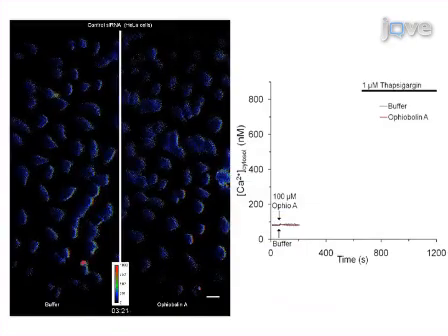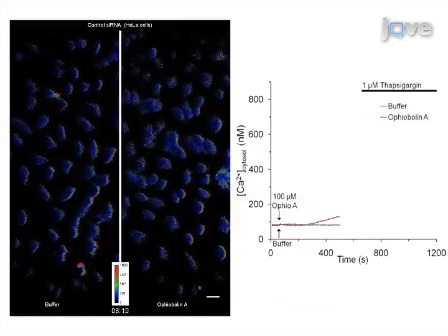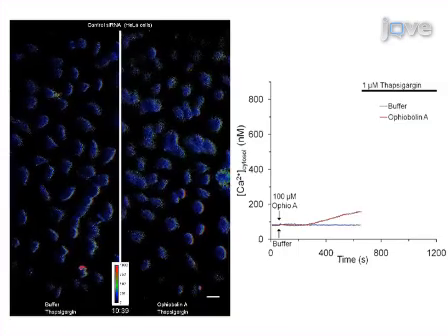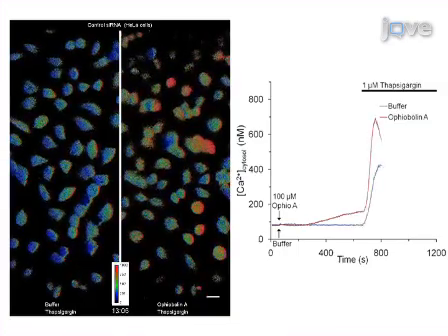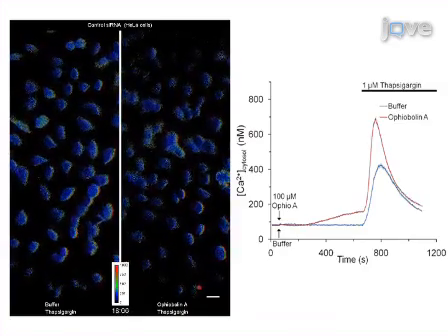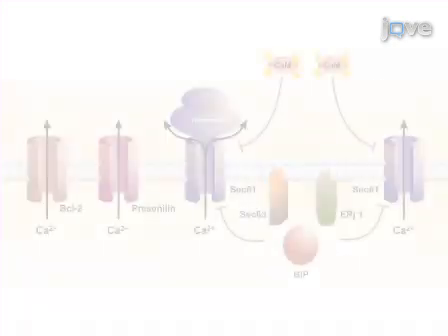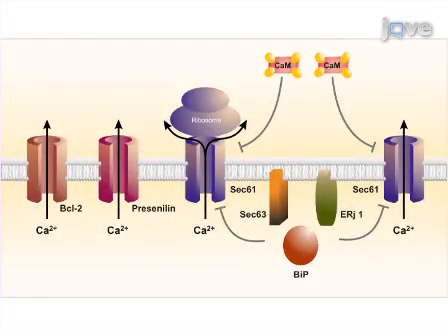As the calcium levels are measured, solution changes are performed to assess the impact of various agents, such as calmodulin antagonists and thapsigargin, on calcium leakage. Quantitative analysis of the resulting images reveals changes in calcium efflux induced by the silencing of Sec61A1. In this video, a model for the role of Sec61A1 in calcium efflux will be presented following demonstration of the procedure and presentation of the results.